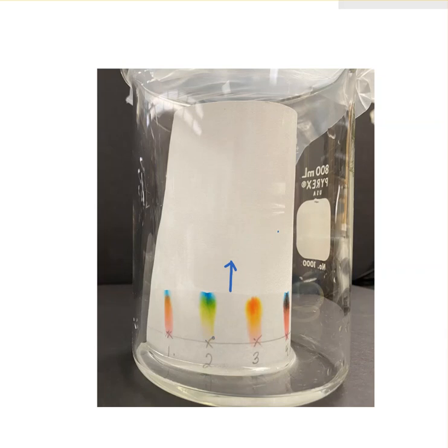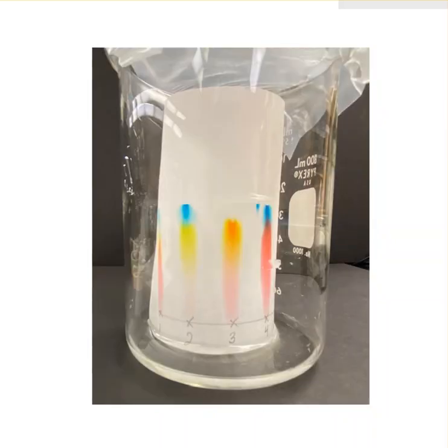This number 2 is turquoise, and it appears that it has a blue compound and a yellow compound in it, and maybe a green one. We'll have to see when it finishes. And we continue. It's getting up there higher. It looks like there's no green compound on that number 2. It looks like we have just 2 pigments.